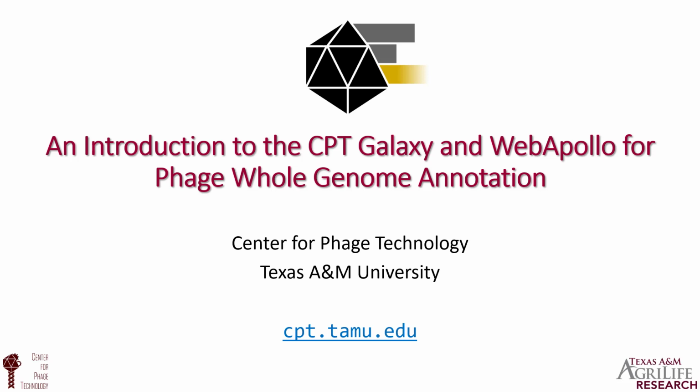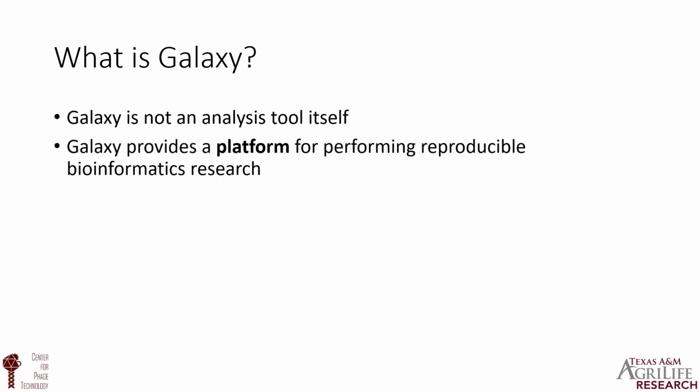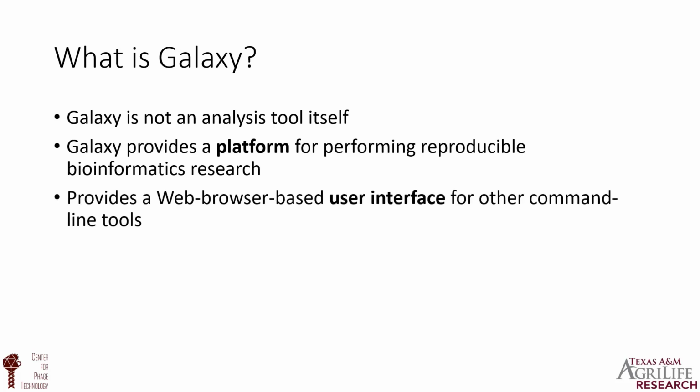In this video, we're going to talk about the Center for Phage Technology's Galaxy and Apollo platform for whole phage genome annotation and analysis. First, we'll start off by talking about what is Galaxy. Galaxy is not an analysis tool in itself. Galaxy provides a platform for performing reproducible bioinformatics research. It provides a web browser-based user interface for other command line tools.